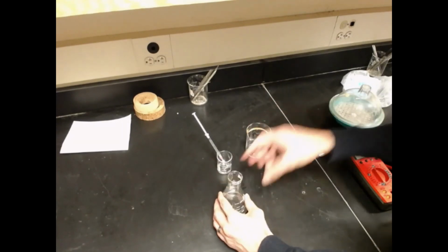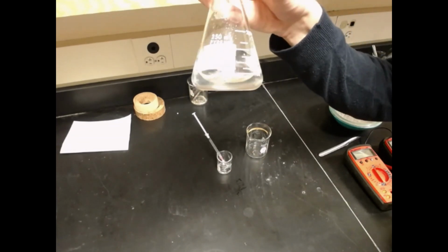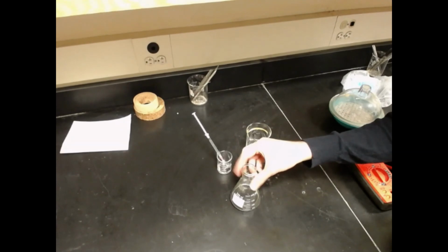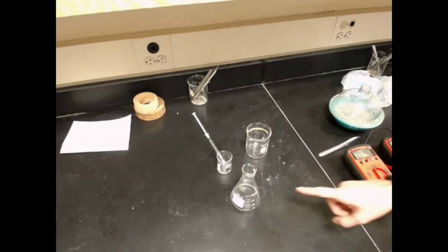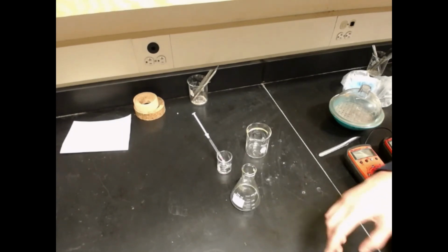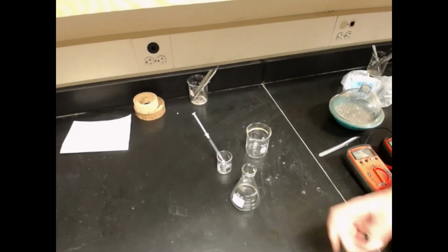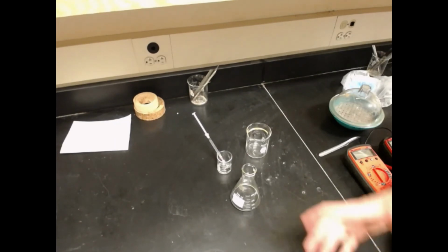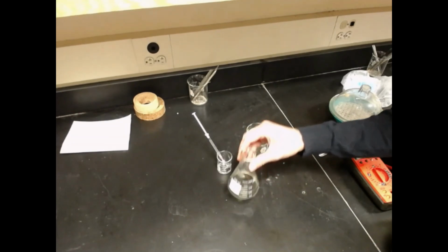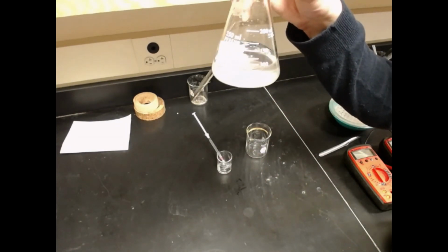So mix these together, swirl this around. I'll move this up here so you can see it. We have a clear solution right now, so nothing's happening. That is because our reaction is happening: we have iodide and persulfate reacting and forming iodine, but the iodine is immediately reacting with the thiosulfate and turning back into iodide. So we don't see that product of the iodine and starch complex until all of the thiosulfate is gone. So nothing too exciting yet.